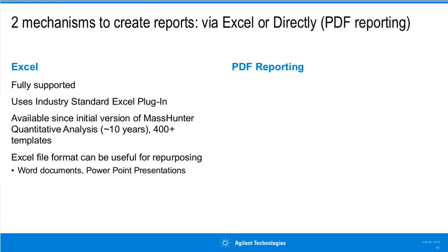And there are also some benefits to using Excel-based reporting for repurposing the information, like the example you saw for the ASMS poster. So using the information in Word documents or PowerPoints, we recognize that that's an important feature. And of course, Excel is very feature-rich and content-rich, and we want to take advantage of that.